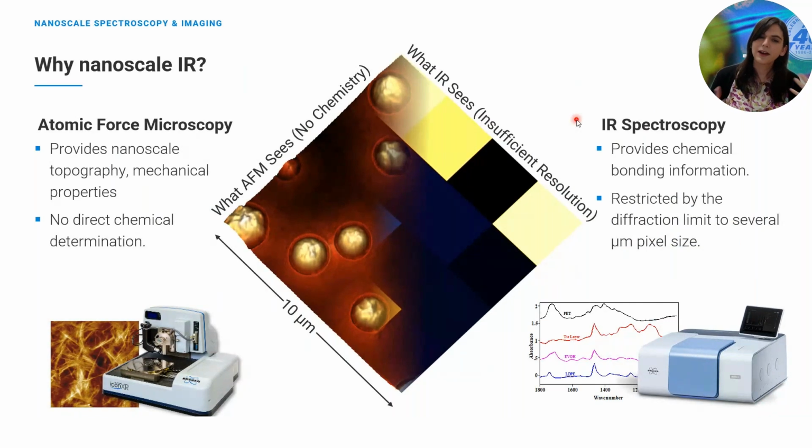So you get this very large wavelength-dependent response, but the minimum resolvable spot is still at the micron level pixel size. That's not really applicable to many phase-separated materials or other types of materials that we're interested in looking at, which have nanoscale chemical structures that we want to be able to evaluate.